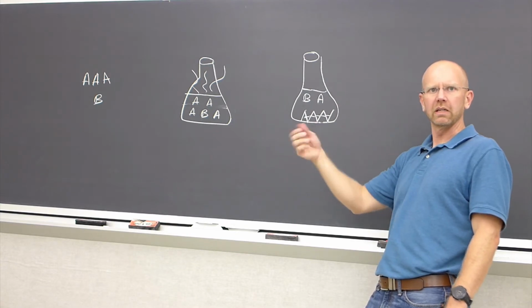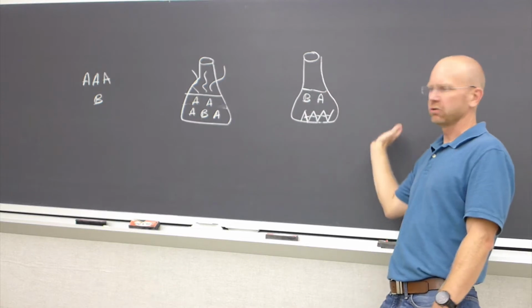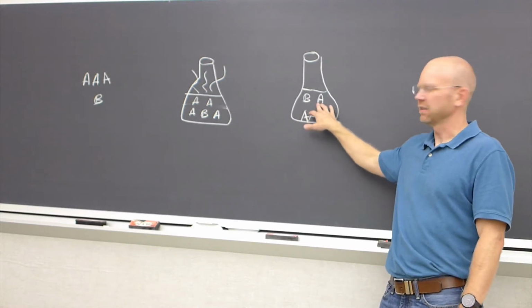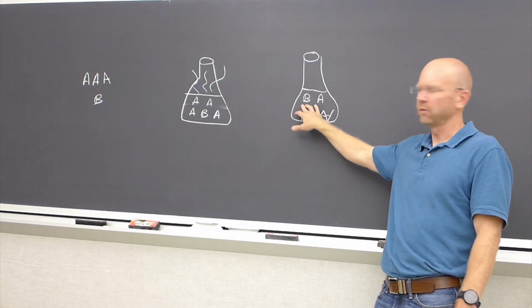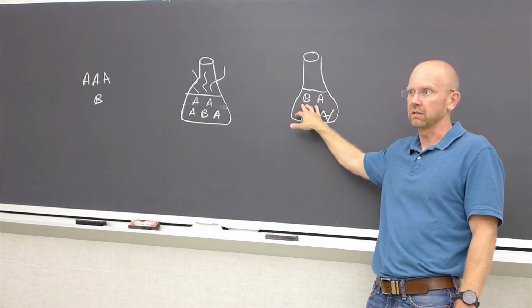Now what we can do is break up those crystals and now do a filtration, right? Because these are in solution, we'll pour those right through the filter, and we'll end up trapping crystals of pure A. You can't avoid losing a little bit of A, because it's going to be maybe a little bit soluble at room temperature, hopefully not too soluble, and hopefully all of B is soluble at room temperature. If its concentration is low, that's likely, right?